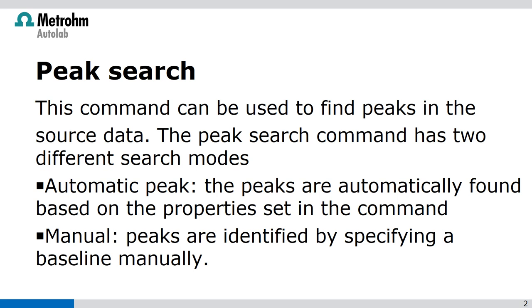Automatic peak: the peaks are automatically found based on the properties set in the command. Or manual peaks, which are identified by specifying a baseline manually.